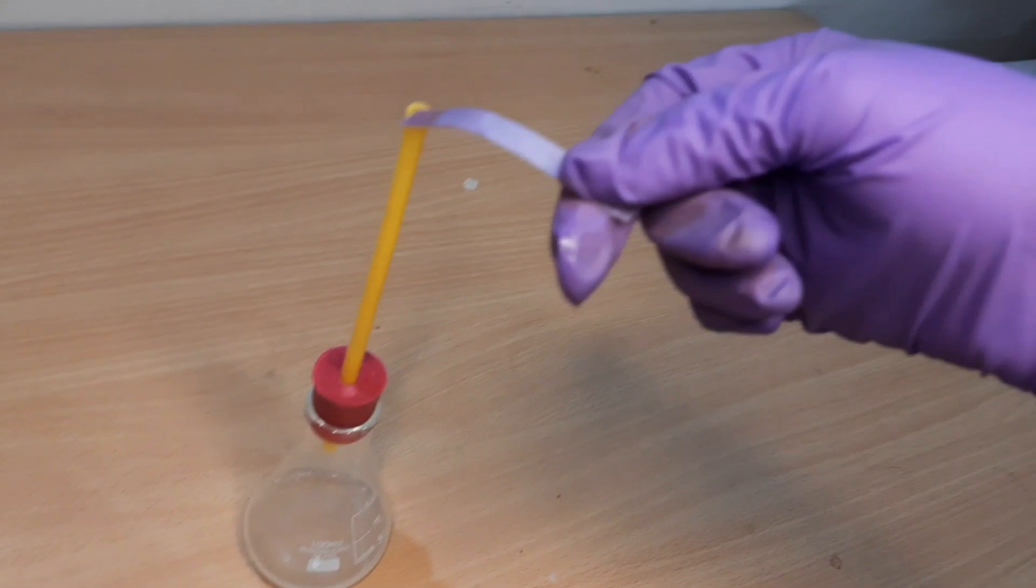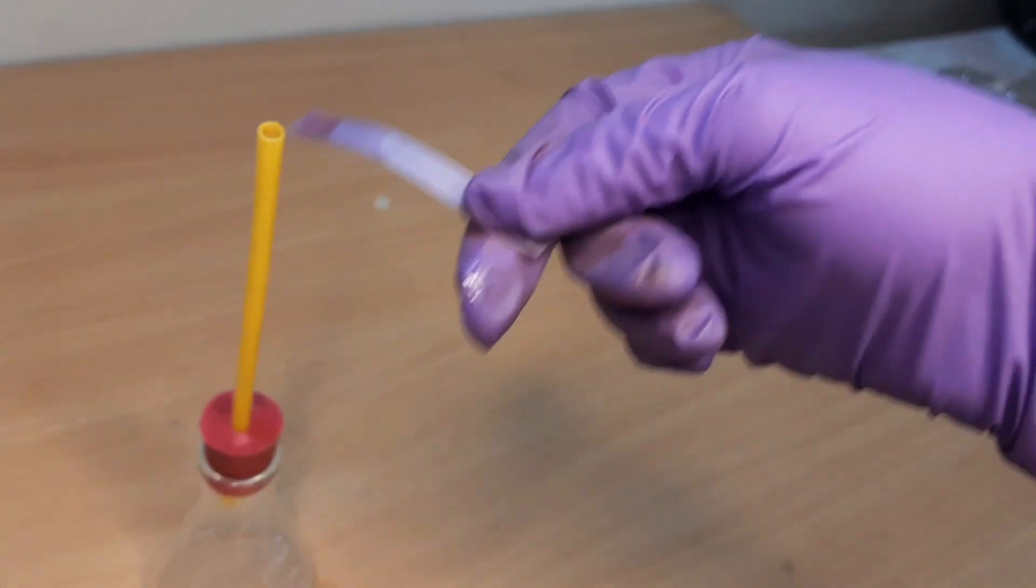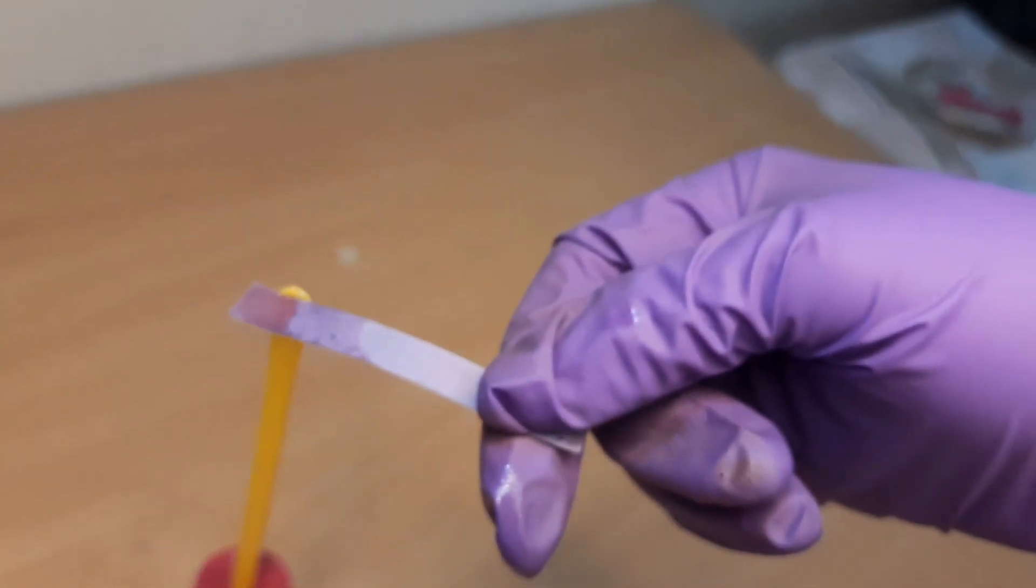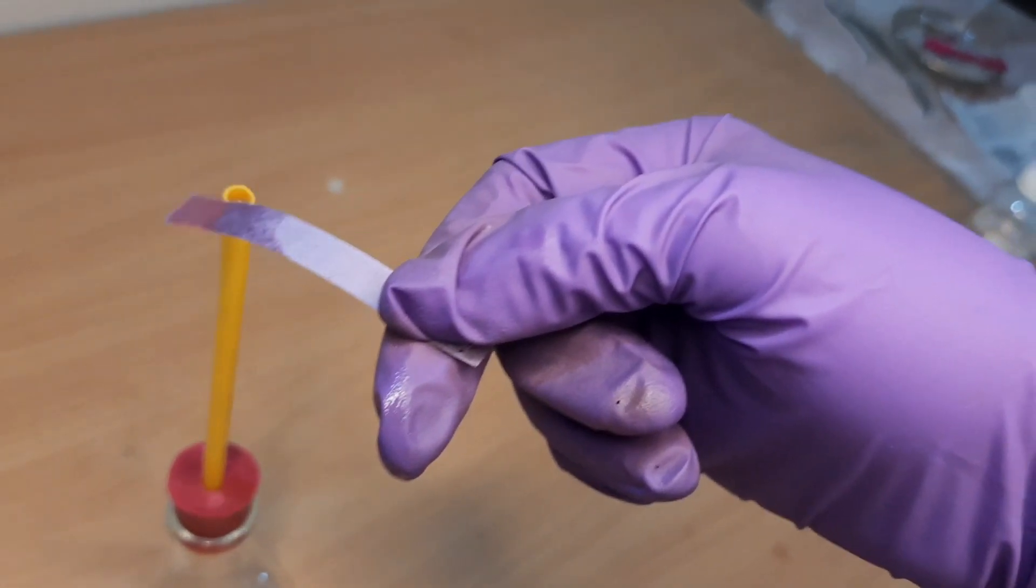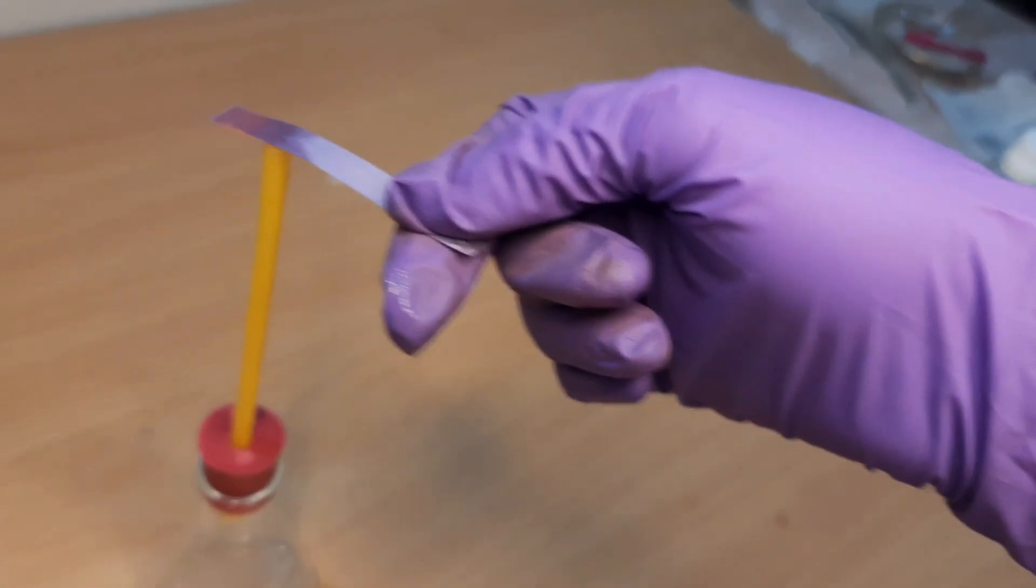Now hold the moist blue litmus paper in hydrogen chloride gas. We will see that moist blue litmus paper turns red. This shows that hydrogen chloride gas shows acidic behavior in the presence of water.